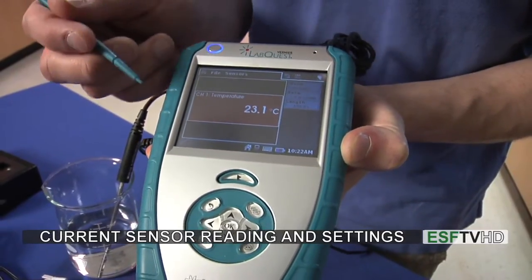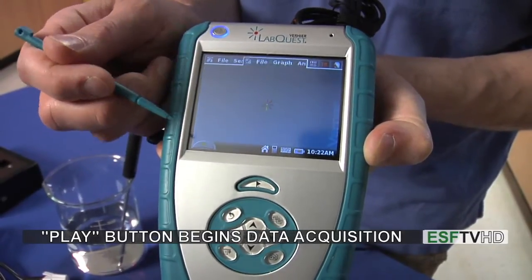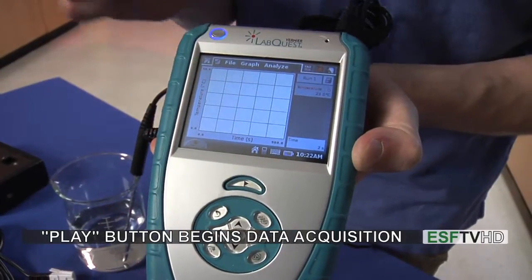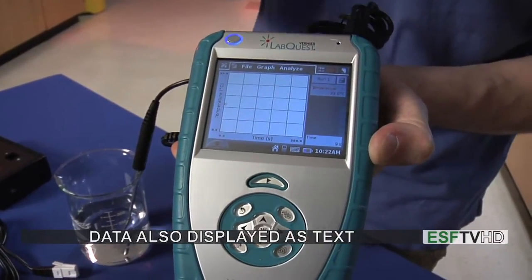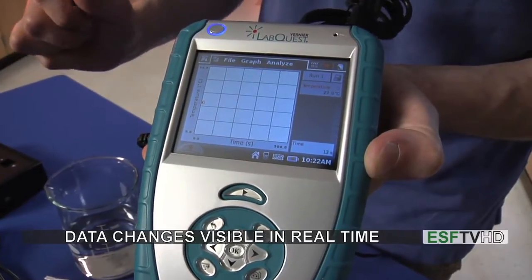And here's my temperature. I'm then going to begin the acquisition process by hitting the play button on the bottom, but I can also hit it right here with my finger, and it will begin recording data. We can see this little red ball floating across the screen and we see the same numbers over here on the screen. If I take the temperature probe out of the water we'll see the temperature change a little bit.